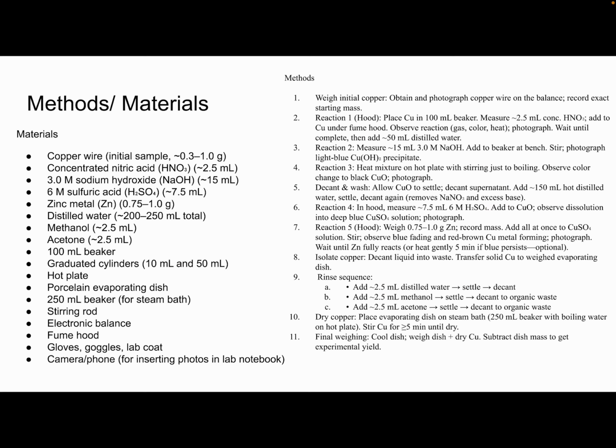wire, concentrated nitric acid, sodium hydroxide, sulfuric acid, zinc, distilled water, methanol, acetone, 100 milliliter beaker, graduated cylinder, hot plate, porcelain evaporating dish, 250 milliliter beaker, stirring rod, electronic balance, fume hood, gloves, goggles, lab coat, camera, and phone. Those were the materials that we used for the lab.